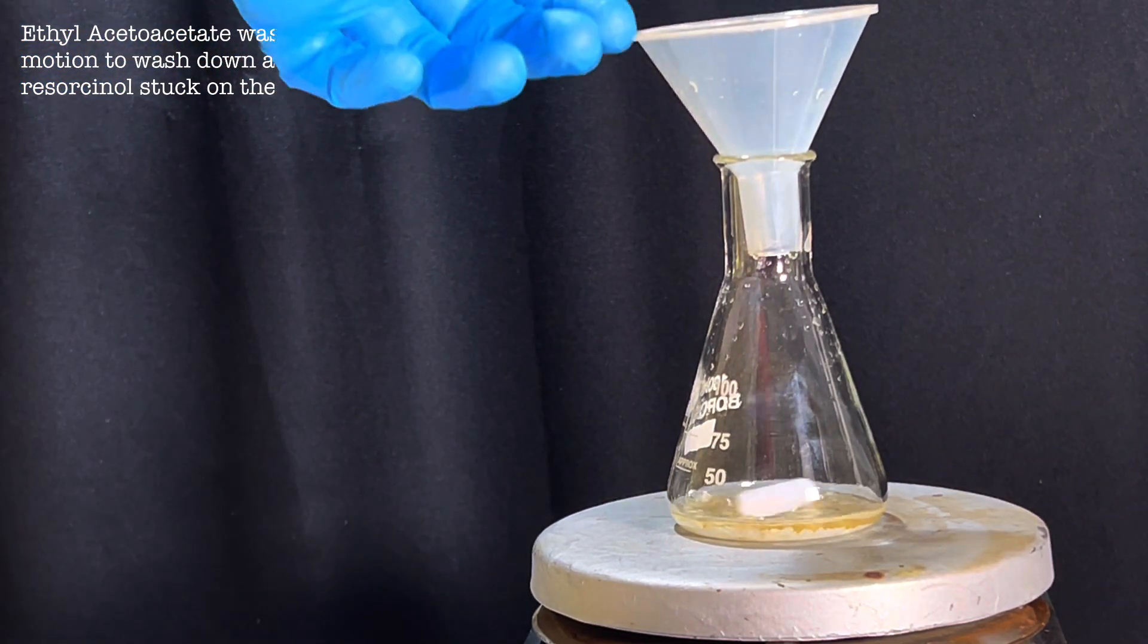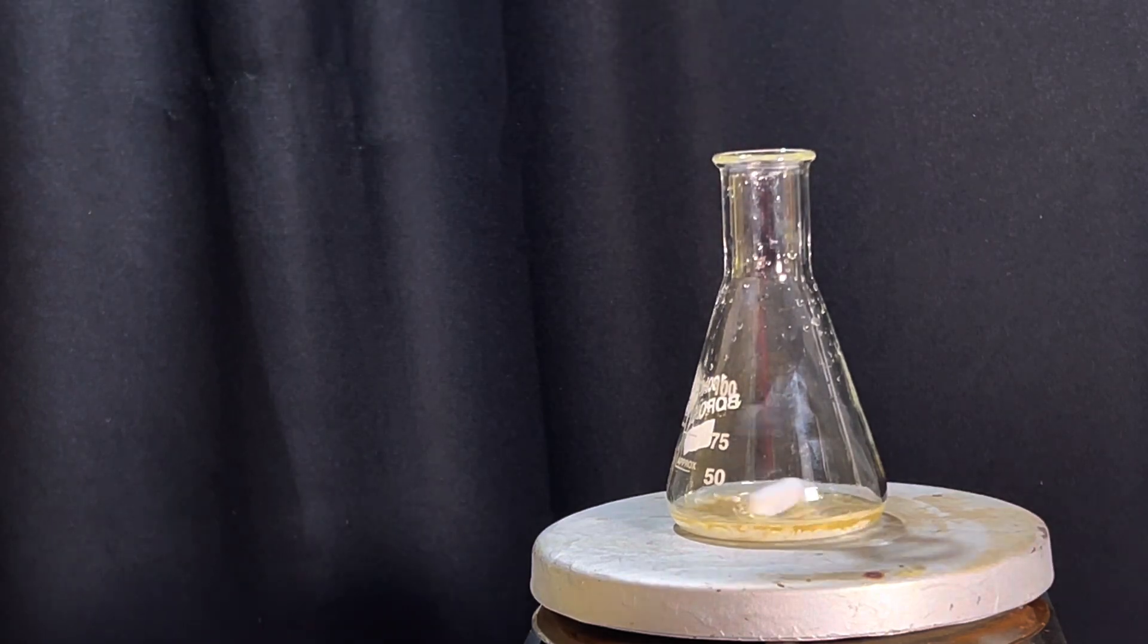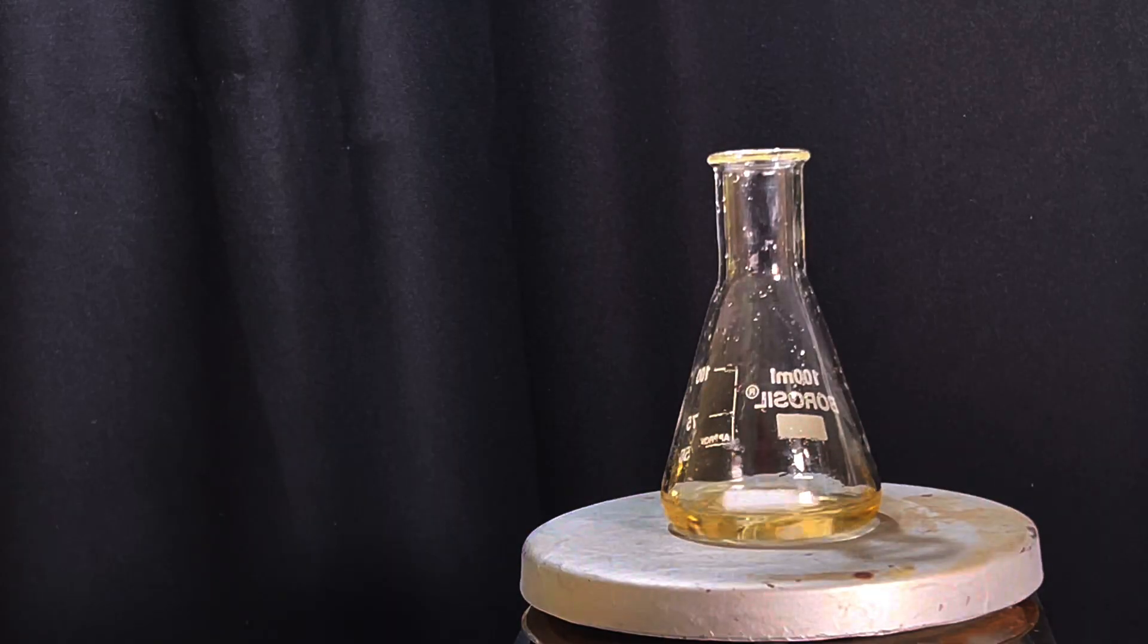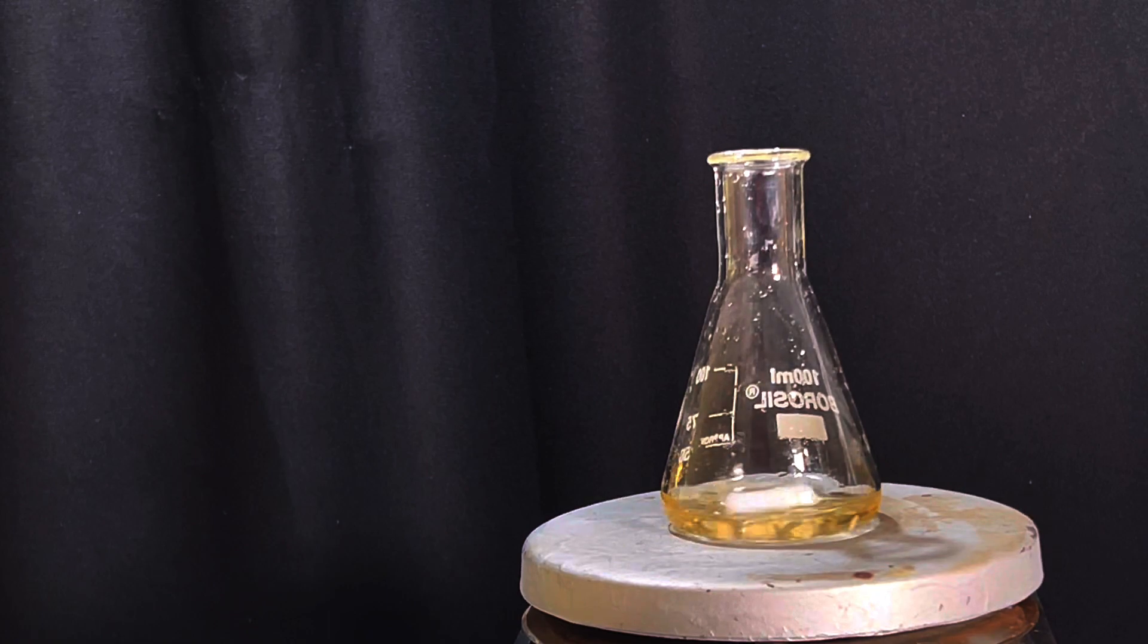With the stirring turned on, resorcinol is dissolved in ethyl acetoacetate. Once everything is dissolved, we are left with a dark yellow clear solution.